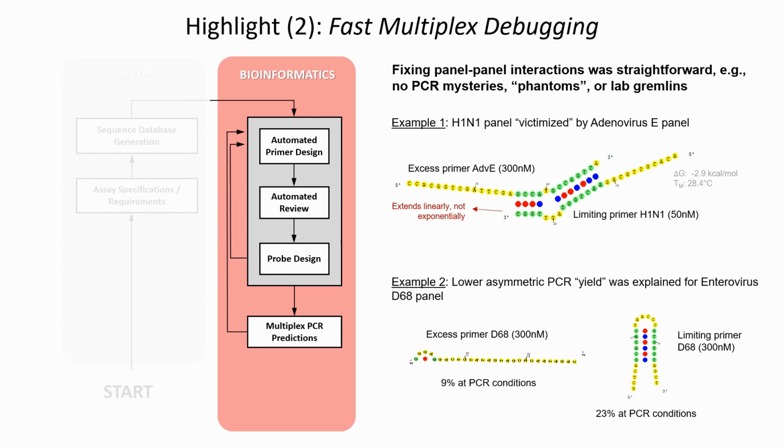And then you go to the level that you try to see, okay, what's going on? Are there any interactions or not? The common interactions that people consider, like primer dimer or amplicon primer interactions, are easily found in the tools. But there is another set of them that will come out. And here are two examples that we see.